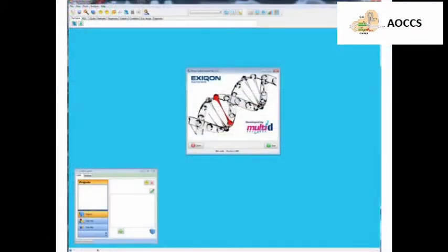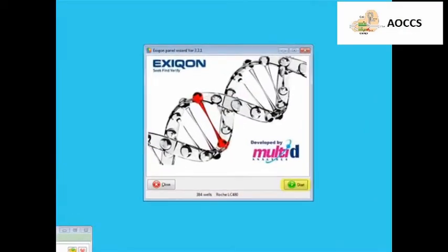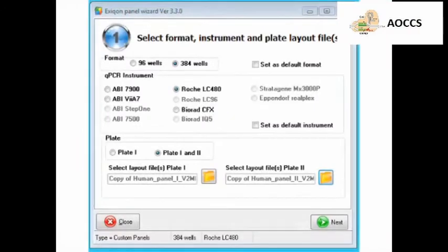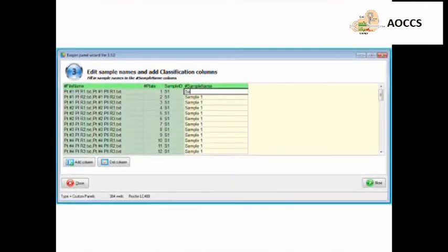Next, import the data into GenEx by first clicking on the Exiqon Import Wizard button, and then clicking Start. At the next window, select the Format, Instrument, and Plate Layout files. Plate Layout Excel files can be downloaded from the Exiqon website. Then, import Panel 1, and click Next.